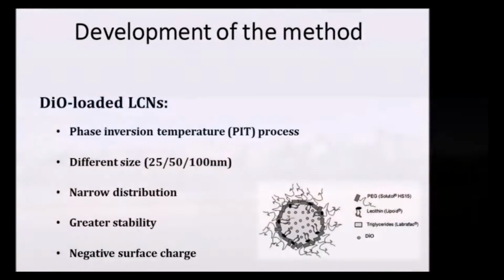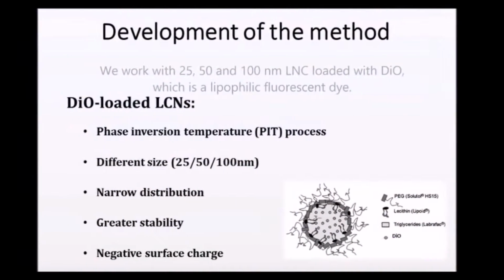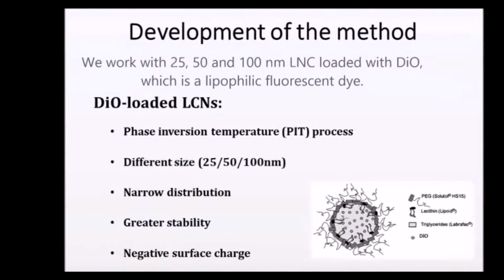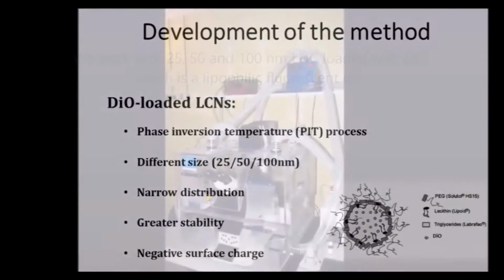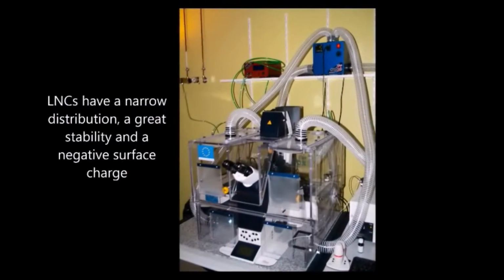Lipid nanocapsule formulation is based on a phase inversion process. We work with 25, 50 and 100 nanometers LNC loaded with DIO, which is a lipophilic fluorescent dye. LNC have narrow distribution, a greater stability and a negative surface charge.